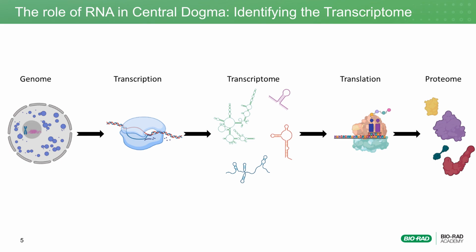To better orient RT-qPCR regarding how scientists study gene products in an experimental capacity, let's first review the basic scientific dogma of biology. The current slide illustrates how a cell interacts with its environment to adapt and survive. Starting on the left-hand side of the slide, we recognize the familiar packaging of genes within the cell's nucleus. During its life cycle, cells will receive signals from the microenvironment that induce transcription of genes.